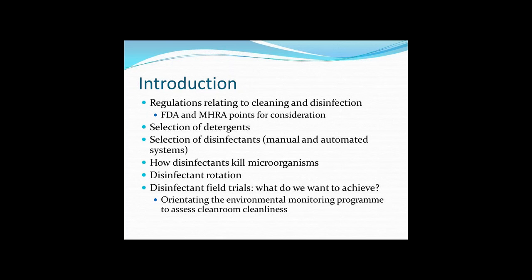Okay, so what we're covering is regulations relating to cleaning and disinfection, something on the selection of detergents, a little on the selection of disinfectants. We'll have a look at how disinfectants kill microorganisms. We touch on the oft disputed subject of disinfectant rotation. We'll then have a look at orientating the environmental monitoring program to assess cleanroom cleanliness.